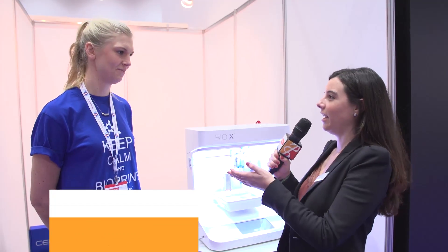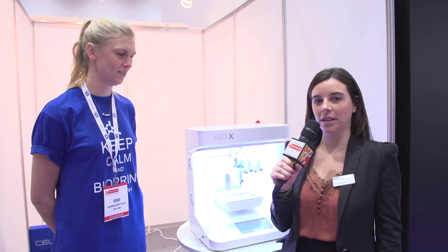Hi, we're going to show you more products here at Arab Health Personal Healthcare Technology Zone. I'm here with Hannah from CellLink and she's going to show us how the BioX 3D printing works.